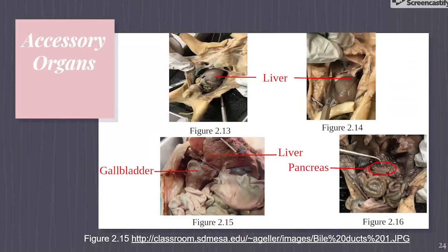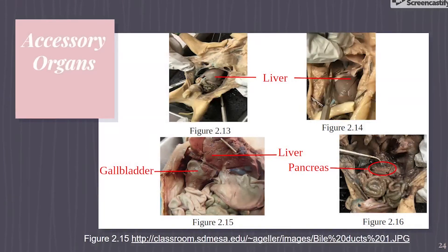Along with all of the main organs in the digestive system, there are accessory organs as well. The liver, pictured in Figures 2.13 and 2.14, is the organ responsible for the production of bile, which emulsifies fat for easier digestion. The excess bile is stored in the gallbladder, pictured in Figure 2.15 under the liver. In Figure 2.16, the pancreas is circled. The pancreas is responsible for producing many enzymes such as pancreatic amylase, which breaks down starch and glycogen; pancreatic lipase, which breaks down lipids; pepsidases, which break down peptides; and chymotrypsin and trypsin, which break down small polypeptides.